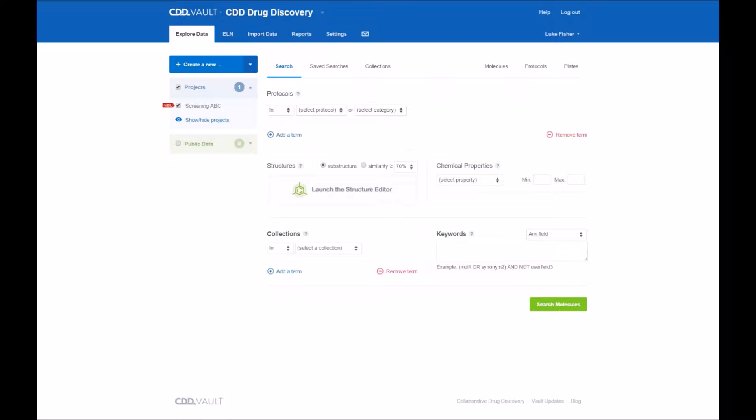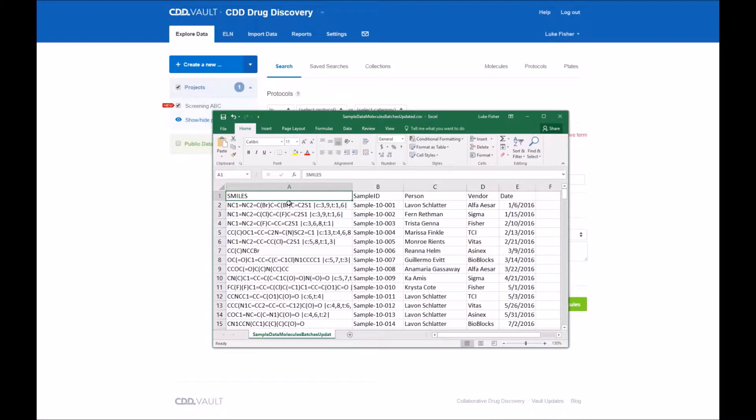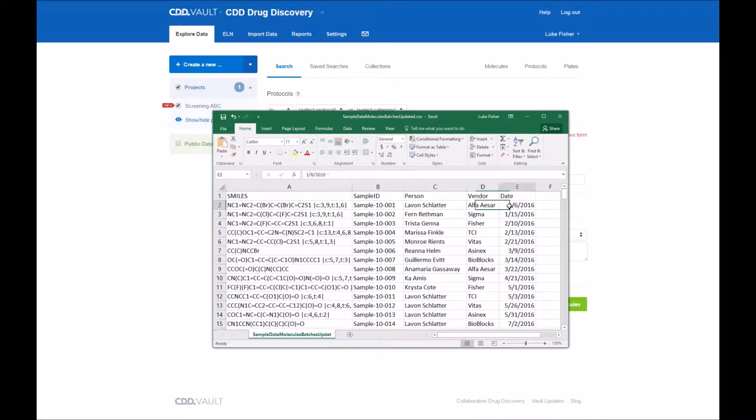In an earlier video we described a simple data set which I will show you briefly here. Again this is a CSV file. We also can read in SDF files but here in this CSV file we have the structure, sample ID, person, vendor, and date as the different fields we'll read in.